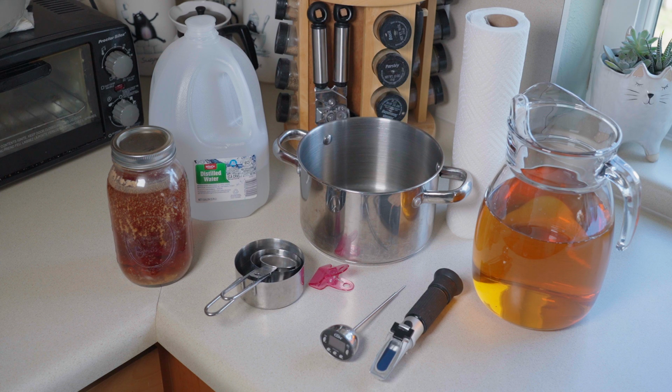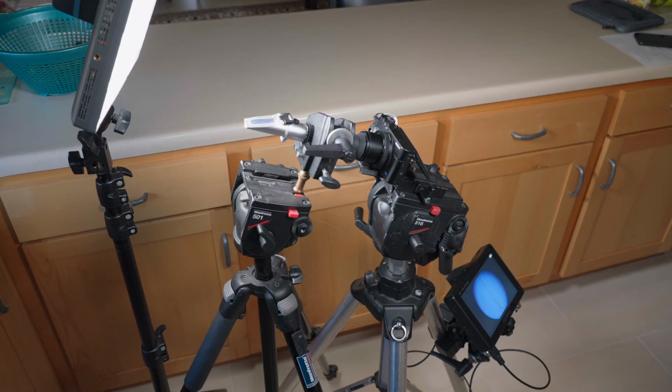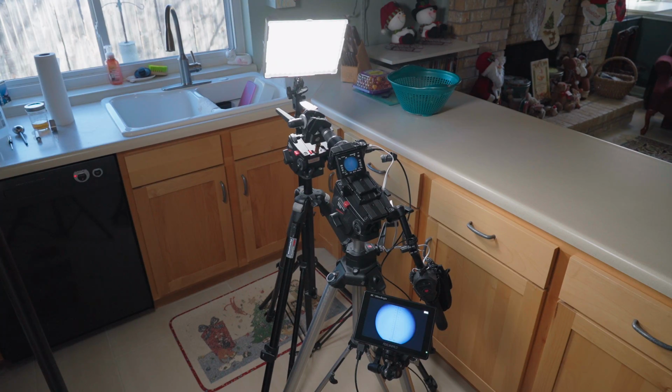We have some distilled water for the calibration, a pot, some wort, a thermometer, and some paper towels. I wanted to be able to conduct the experiments without really handling the refractometer too much, so I put it inside what we call a super clamp, and that's on top of a small tripod. You can see it here. I've also got the camera on a second tripod, set at the correct angle to look into the refractometer. And you can also see I have a light blasting into the instrument so the camera can get a solid image.